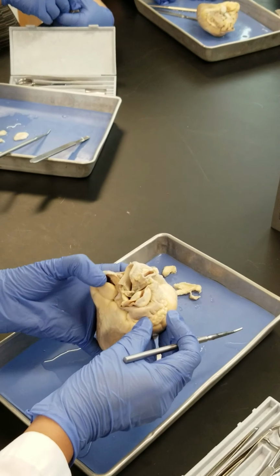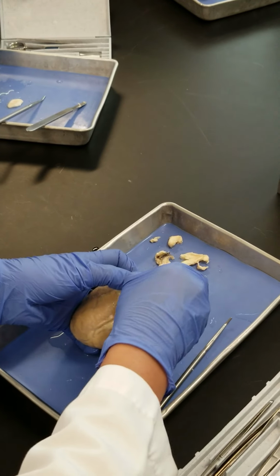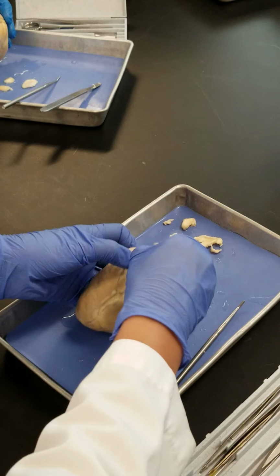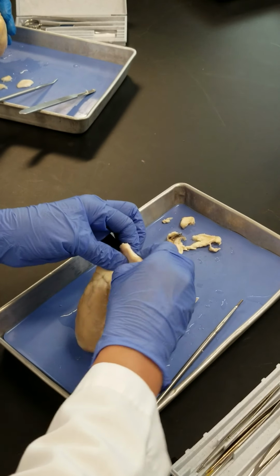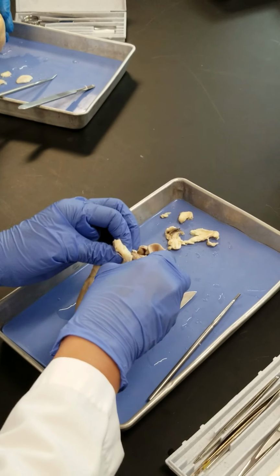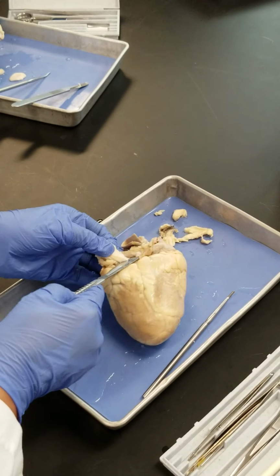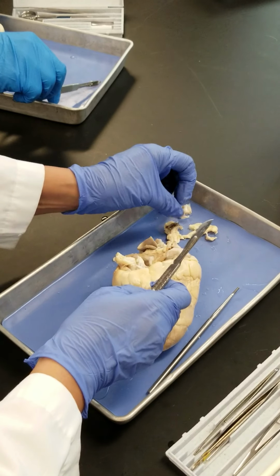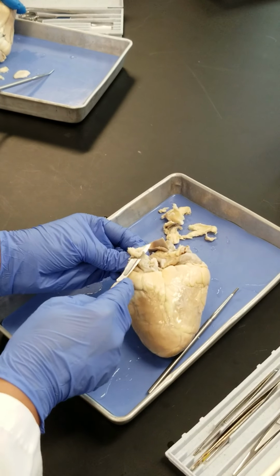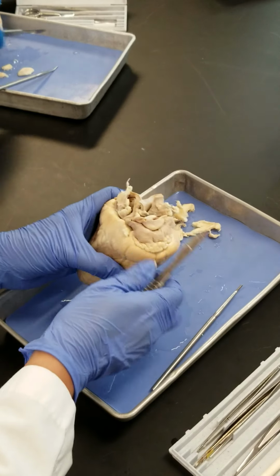So over here, as you said, we have lots of fat. I'm gonna push this fat away so that you can see the wall of the atrium at least a little bit. This sheep has been very lazy. Hasn't done much exercise. They provide grass for him or her, and there's a lot of fat. Right. We can see the outside wall.